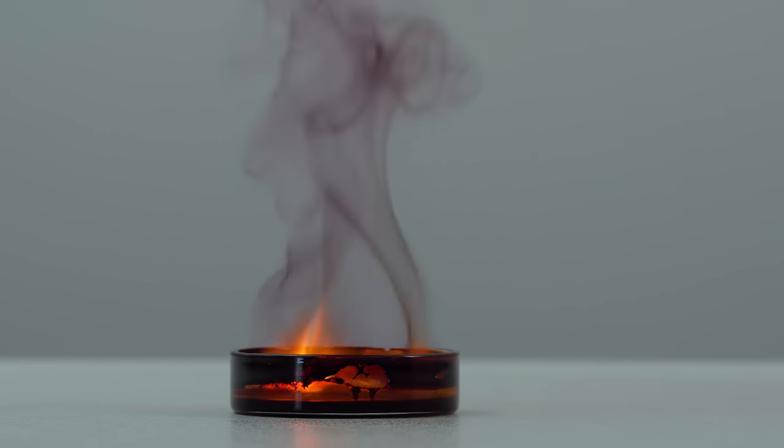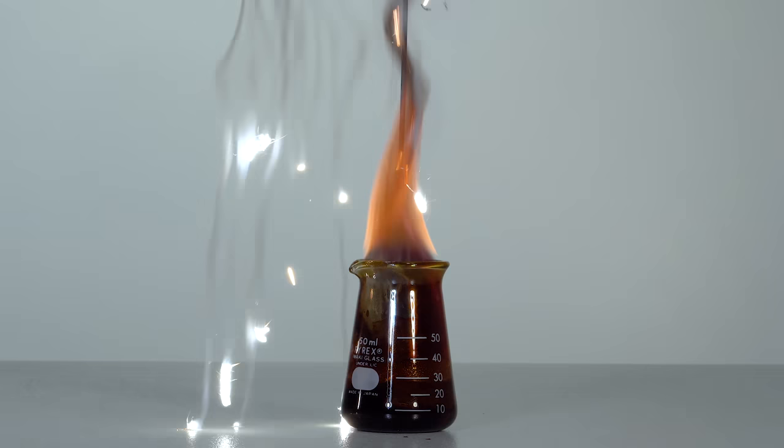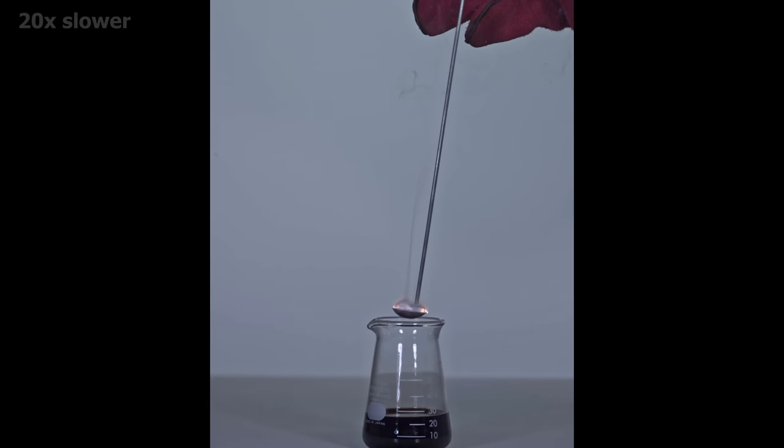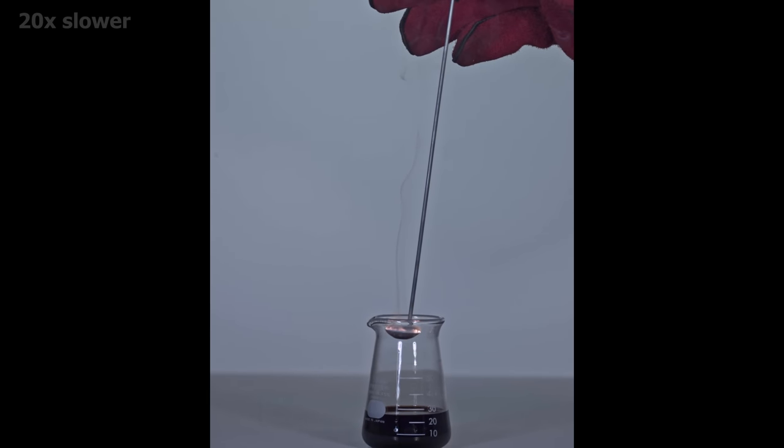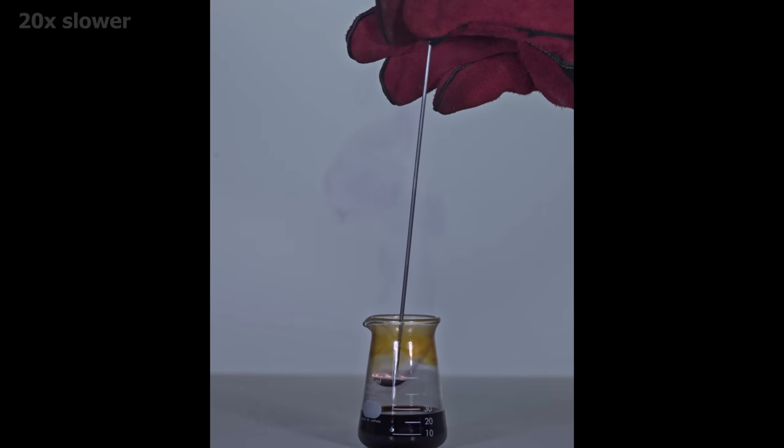I wonder how much iodine it will emit if I drop it in burning magnesium. Methylene iodide is quite volatile and we can see the emission of iodine vapors before burning metal comes in contact with the liquid.